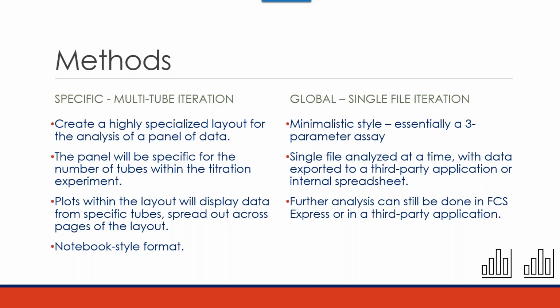And the overall benefit is that basically that layout has this notebook style format. So that way you have all the information about that titration experiment within one layout. You can batch that data out, and then you have an archived copy of that data if you use the save layout option as part of that batching technique. Okay, and thankfully we've done a lot of that work for you through that layout that Robin presented.